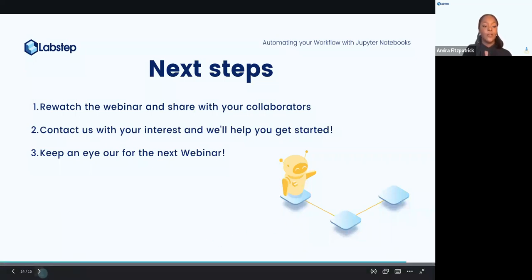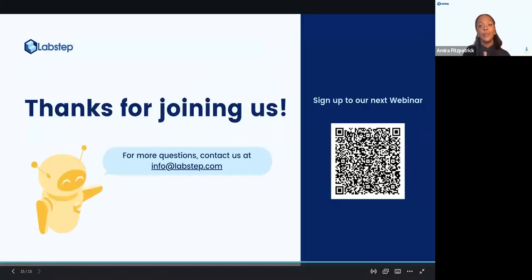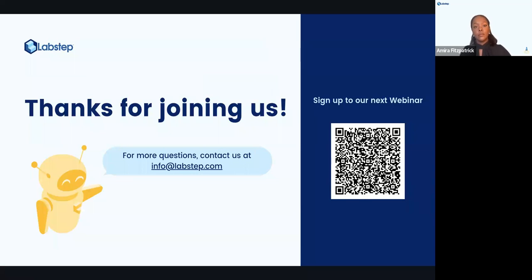Ethan, I don't know if we had a few more questions trickling in before we finish up. None at the moment. Okay. Charlotte, how easy is it to get our Labstep customers set up on Jupyter Notebooks? To actually get the functionality switched on for them, that's no trouble at all. Just get in touch and we can do it really quickly, ASAP. If you need any support with how to write your scripts, it depends on what is required, but we'll be on hand as quickly as possible, and we can certainly quickly send you some example scripts to get you up and running.